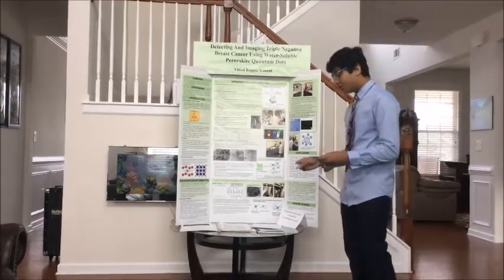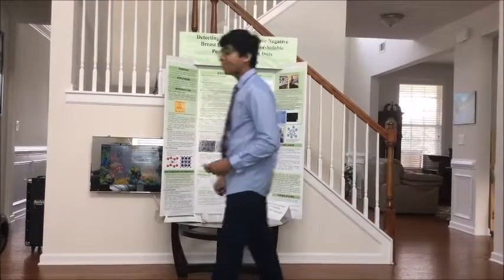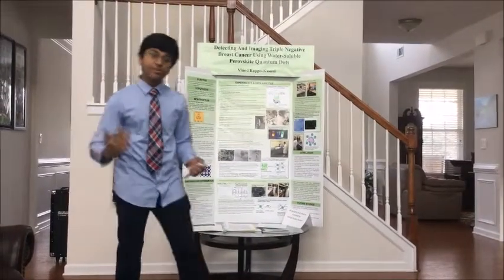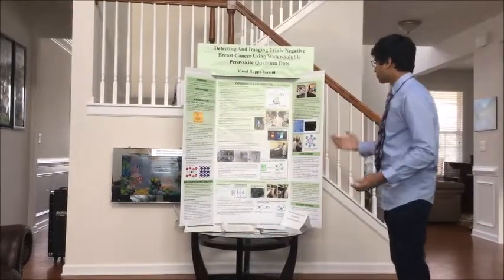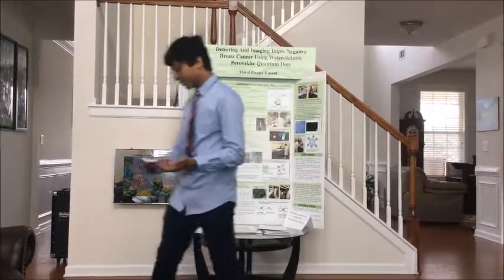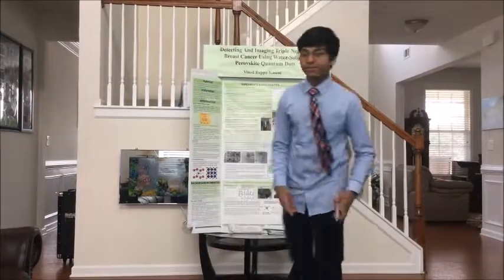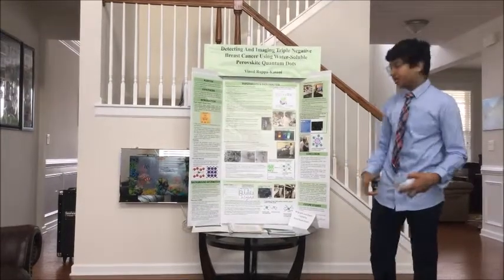So now I'm going to get into my summary and conclusions. With my project, I accomplished the perovskite material being stable in biological settings and water stable. And this is using polymer coating with Pluronic F127. There was an extremely high photoluminescence quantum yield with my perovskite material, and this is why I wanted to use it. And it produced a bright green color, as you can see in the fluorescent microscope image.